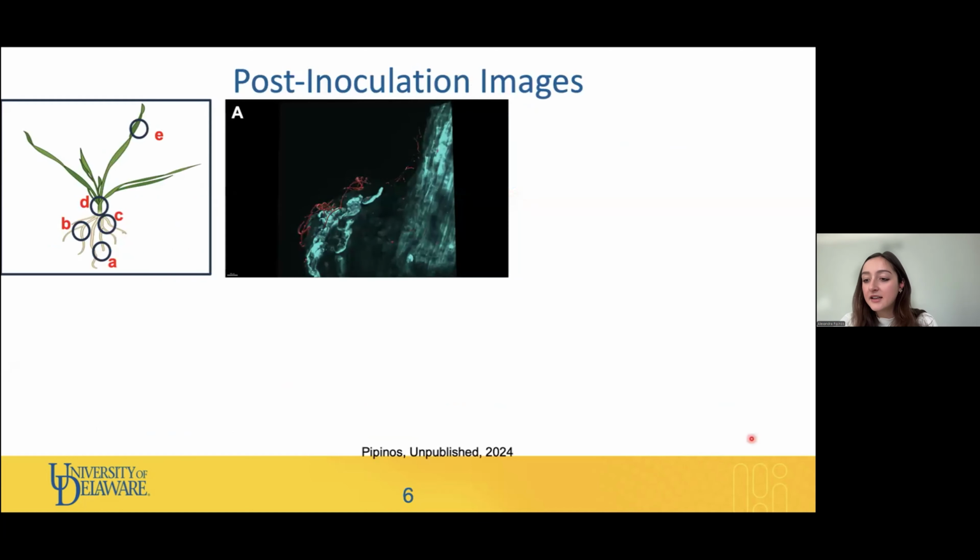Okay, so then we come to the images. We determined that Streptomyces coelicolor utilizes its hyphal extension properties in combination with plant root interactions to distribute itself throughout the three imaged root regions that we looked at. We looked at the root tip, which is also known as the elongation zone, the middle root, and the upper root, which is also known as the maturation zone. By day 5, after inoculation of bacteria onto roots, we found that Streptomyces coelicolor colonization was evident across all three regions.